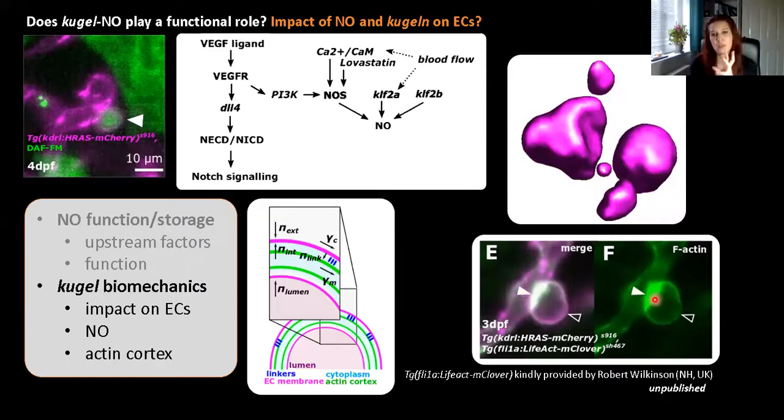And so now we really want to know how both the membrane and the actin form together and how they dynamically interact during the lifetime of a Kugel. For this, we go back to the start, namely using biomedical image analysis. We started just recently examining how to segment and automatically characterize the structure of Kugel. With the segmentation, we're hopefully able to very soon quantify the surface, their volume, their curvature, etc., and then examine this over the lifetime of a Kugel together with the actin cortex. But like I said, this is still very much work in progress.